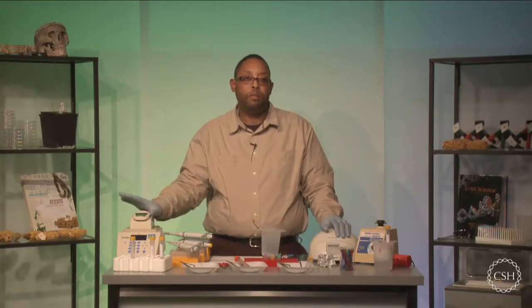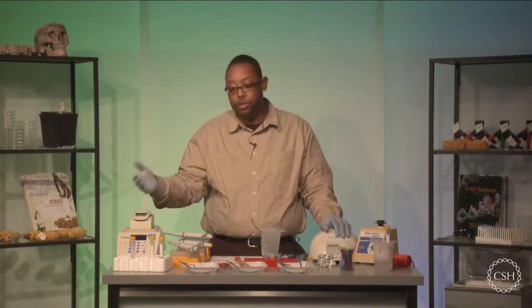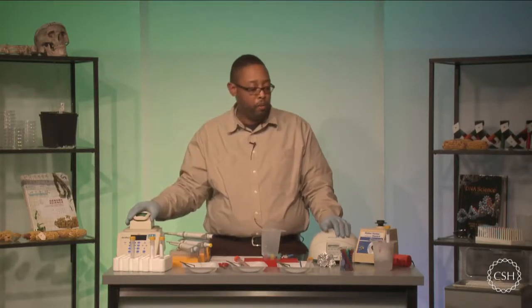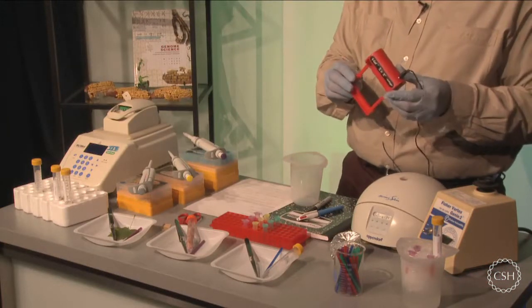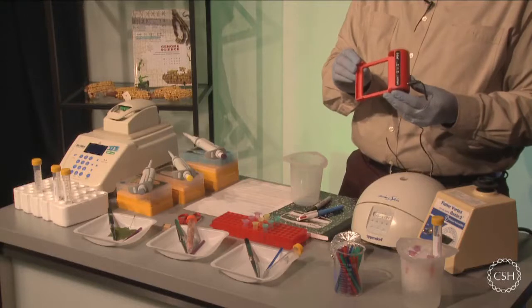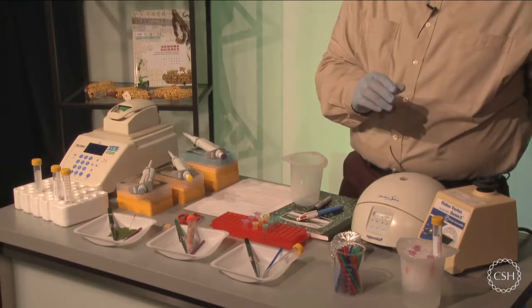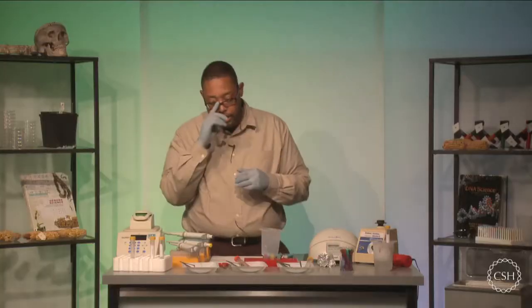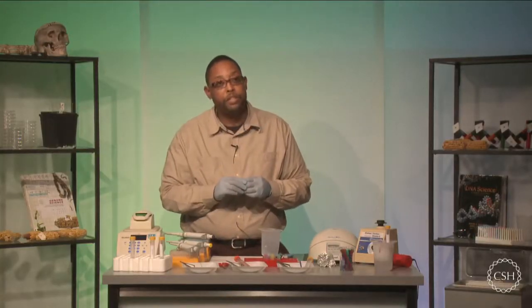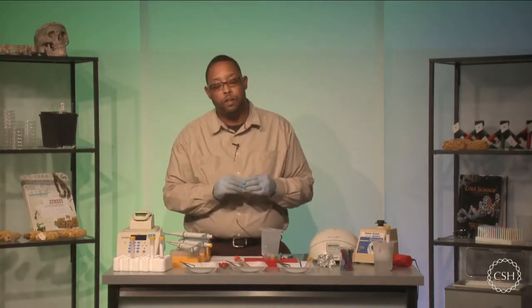and then lead to subsequent identification on some type of matrix, whether you have an agarose gel in the classical manner, or you will be moving on to using some other form of an electrophoresis box in which you can use a product like an e-gel, which is sold by Invitrogen. Okay? So what we're going to do is just get started, and I'll show you how to do the isolations from all 3 of these types of tissue here.